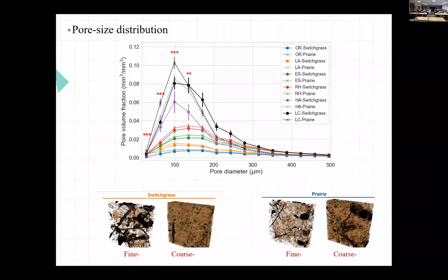Something to keep in mind when working with CT data, and pores or pieces of organic matter or whatever you want to identify on the image, is that even though your scanning resolution, in our case, is 18 microns, the objects we can realistically identify and work with are at least twice that resolution, or better, 4 or 5 times bigger than the resolution.